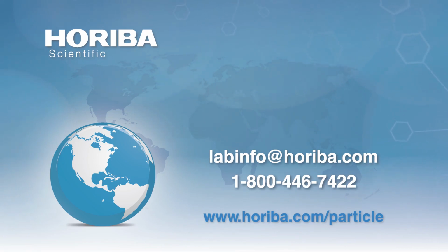and other processing variables. Okay, another one for you, Chris. Is the Icon 2 EXP, I imagine that's explosion proof, can it be used with solvent-based fluid bed applications? Yes, it is, and yes, it can. It is ATEX Zone 22, so that's for dusts and gases, and then depending on the part of the world you're in, there is an IECEx equivalent version also available.